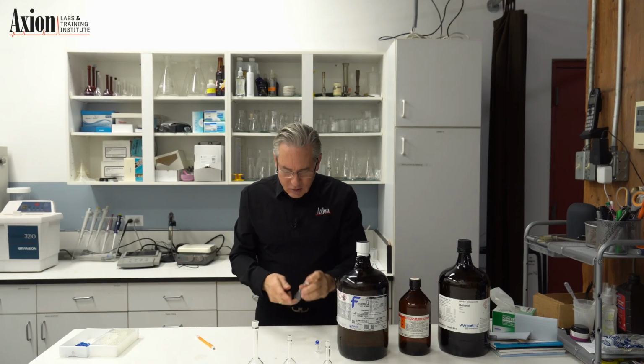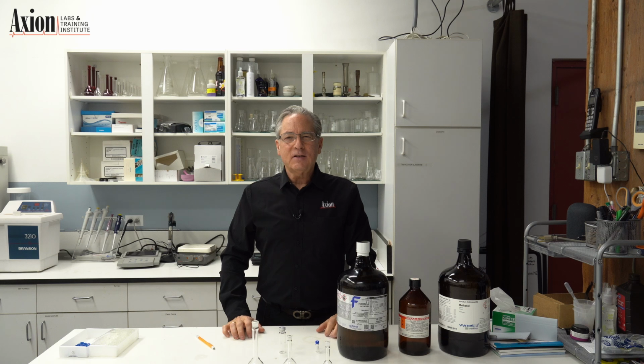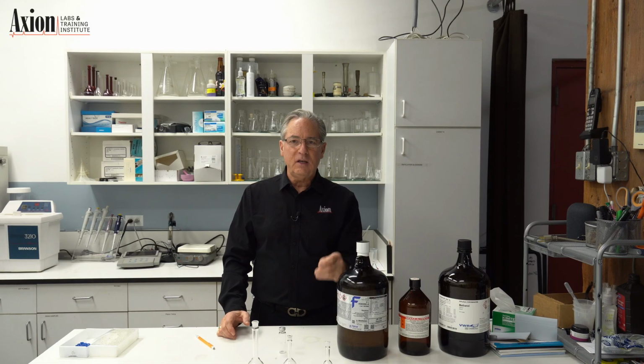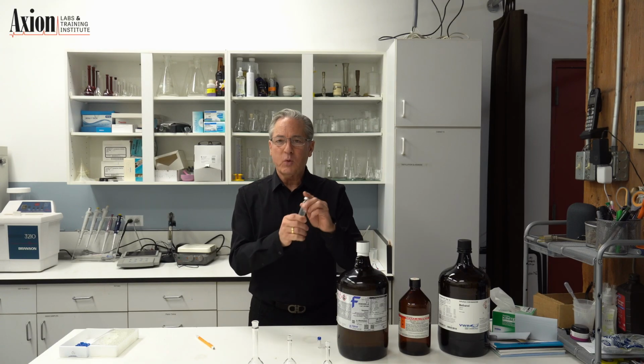So let me give you a good example. If I wanted to analyze soil, dirt, for gasoline, how would I do that? Well, dirt, I can't dissolve it. I can't put it in this little vial, and if I try and inject dirt, it's going to mess up the GC. But in this case, I just care about the vapor above the dirt, right? The dirt smells like gasoline, so that's what I'm going to get here.